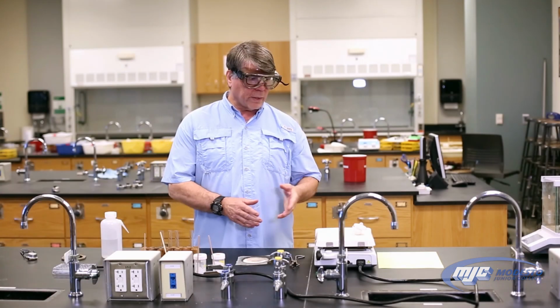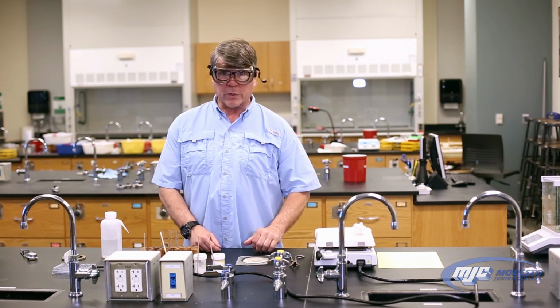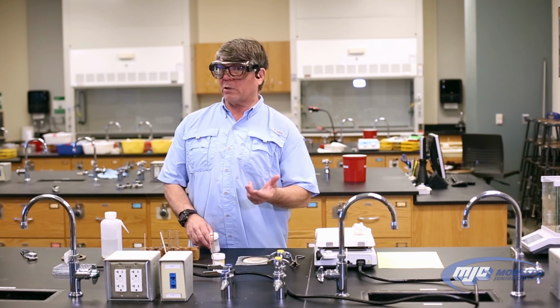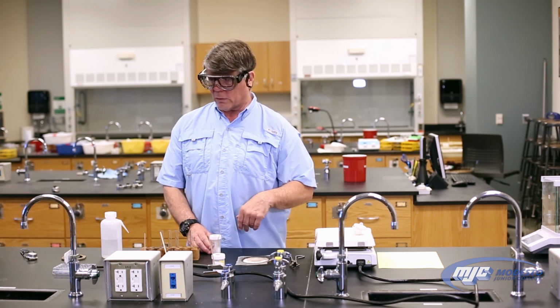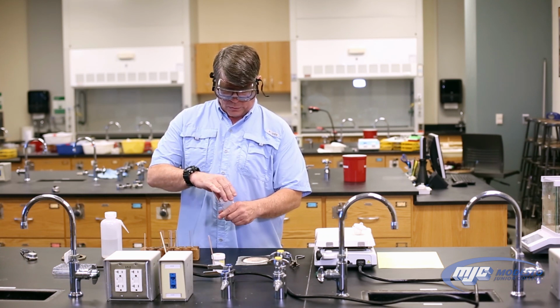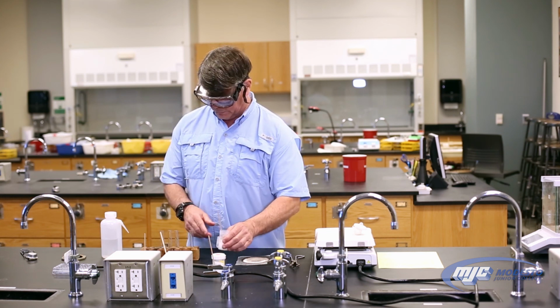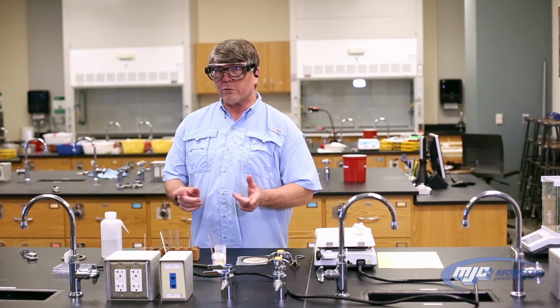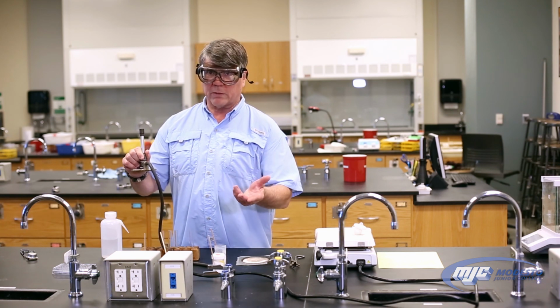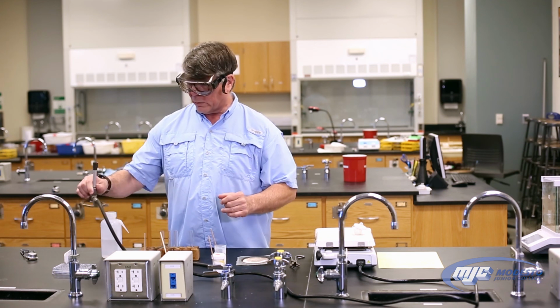All right, guys, so while we're waiting for our hydrate to heat up and to drive all the water molecules away, we're going to do the flame test, and if we have to, the magnesium strip test. I'm going to show you what all the unknowns would look like, so you get a chance to see. In your data, you're going to get a picture of one of these. First, we're going to use a Bunsen burner to do the flame test, and we haven't used that yet in this class, so I need to explain how to use it and how it works.